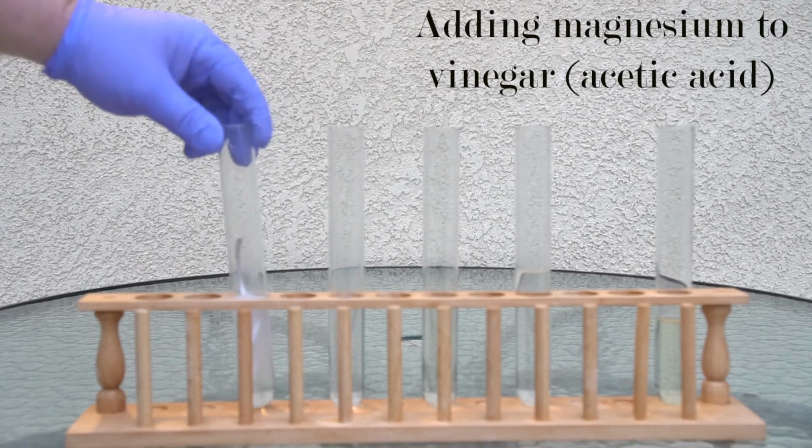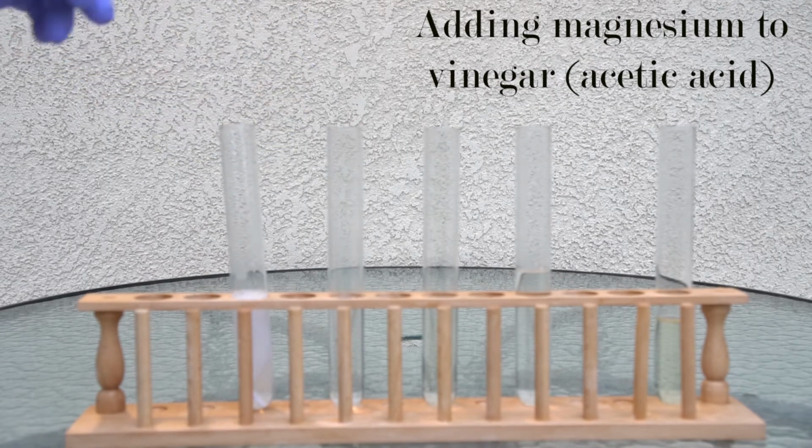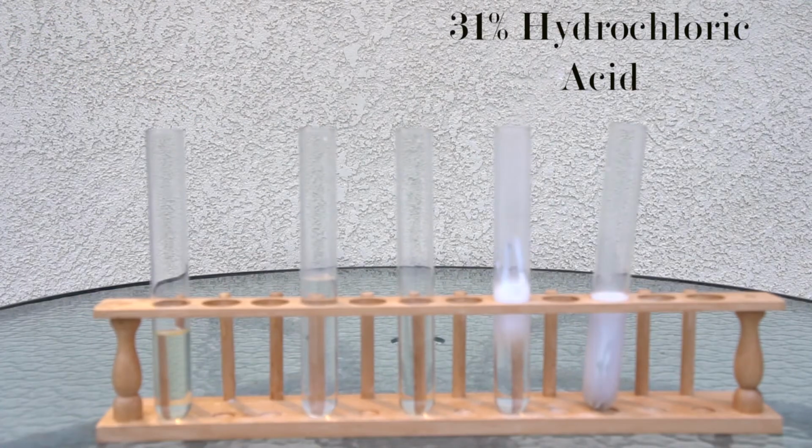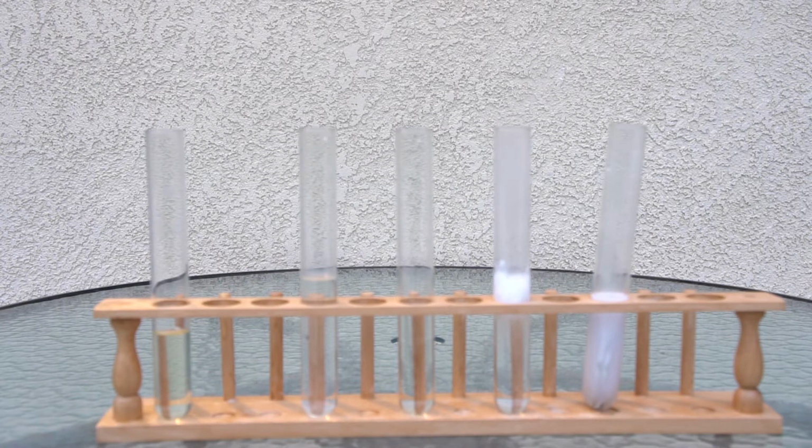So as you can see, the magnesium is reacting with the acetic acid to produce hydrogen gas at a noticeable rate. Moving on to the hydrochloric acid, this was by far the fastest reaction, with the magnesium jumping up and dancing on top of the acid because it was so reactive. Again, hydrogen gas was produced along with gaseous hydrogen chloride. Good thing we did these acid tests outside because there were definitely hydrogen chloride fumes being produced.